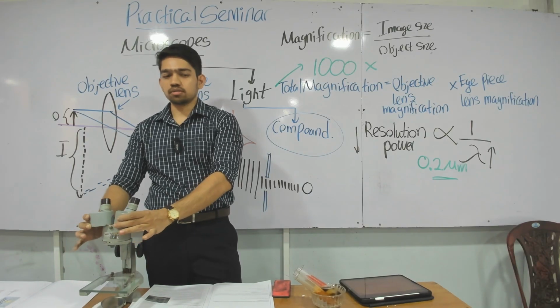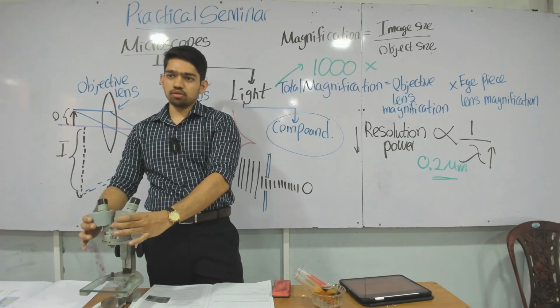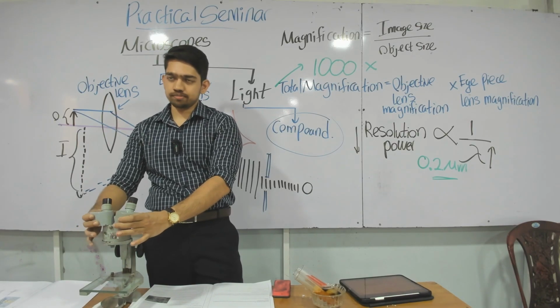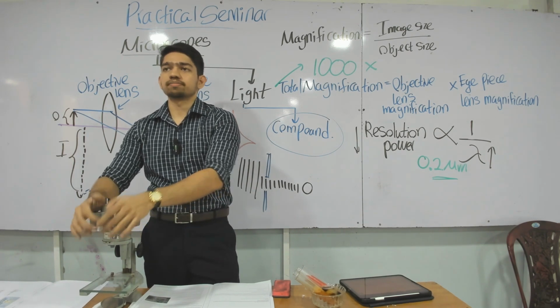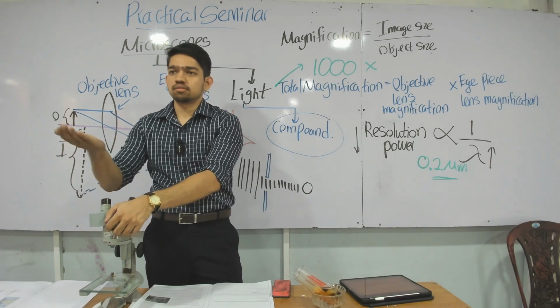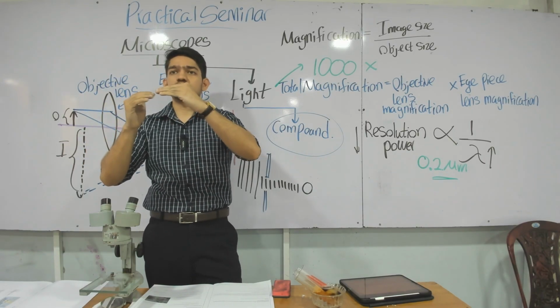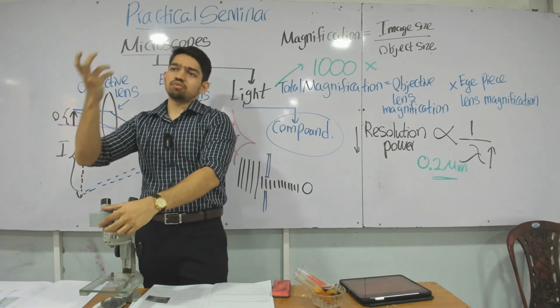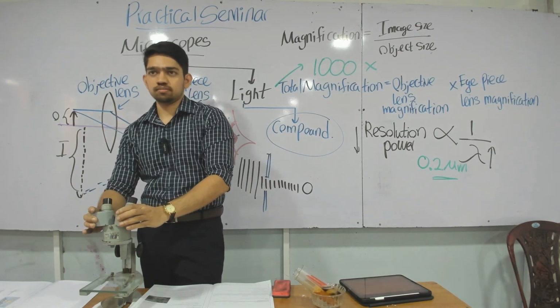You have two eyepieces. Usually, most school microscopes have only one eyepiece. Using this binocular vision, you can get a sort of depth idea, if certain cells are above or beyond others. You can get a better 3D view if you look through two eyes.